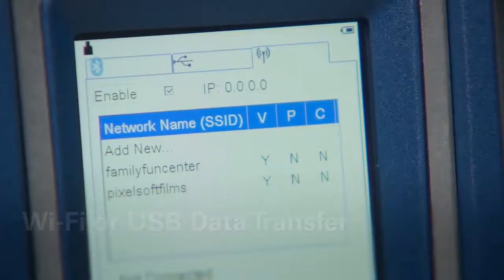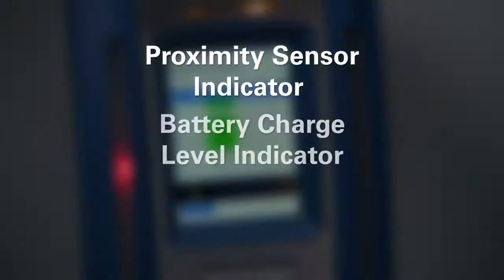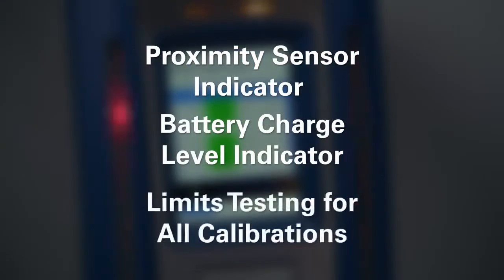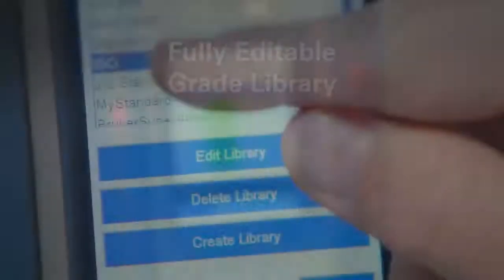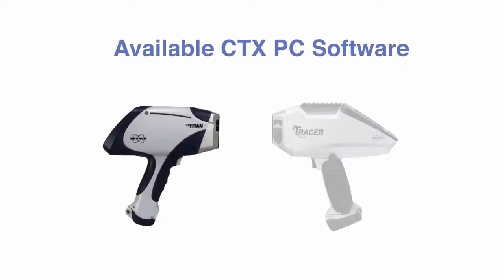Additional features include Bluetooth connection, proximity sensor indicator, battery charge level indicator, limits testing available for all calibrations, and a fully editable grade library. The CTX also has the same PC software available as Bruker's proven S1 Titan and Tracer 5i portable handheld XRFs.